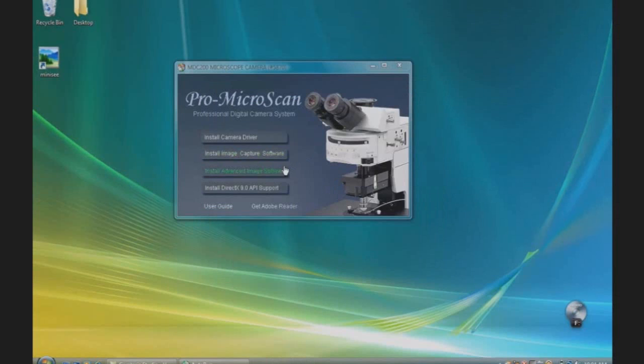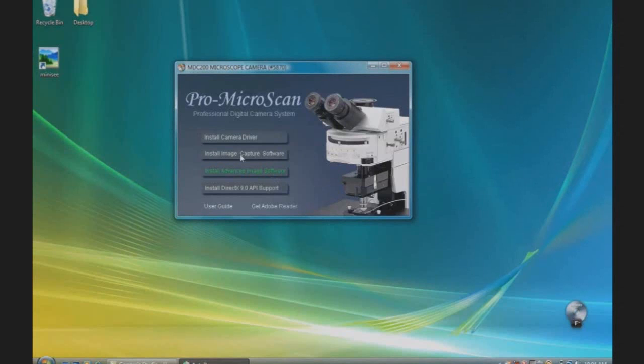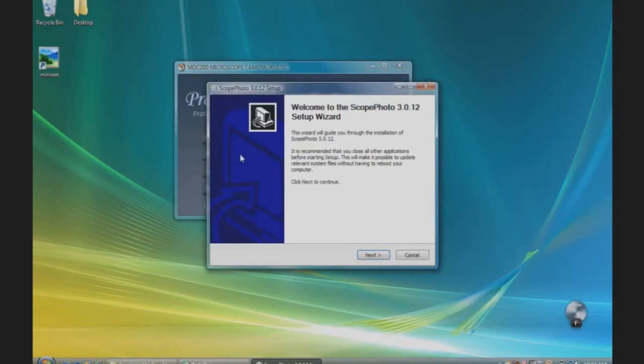We will now install the Advanced Image Software. Follow the Scope Photo setup wizard.